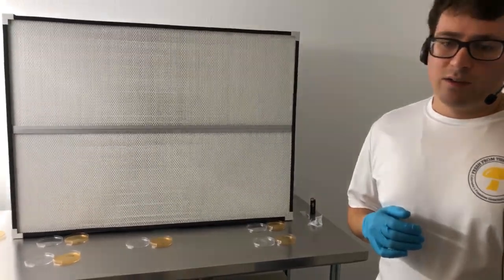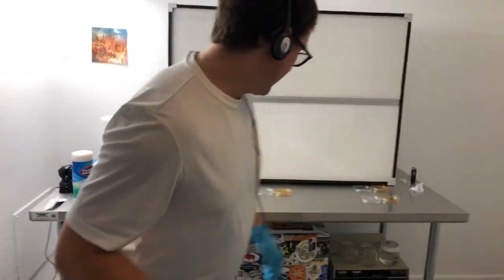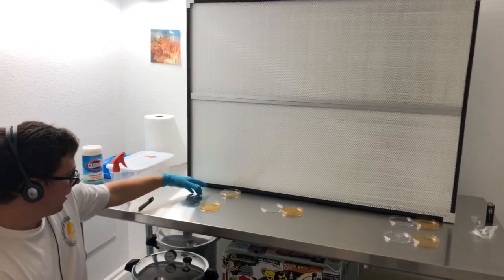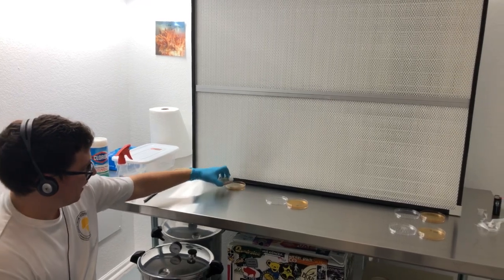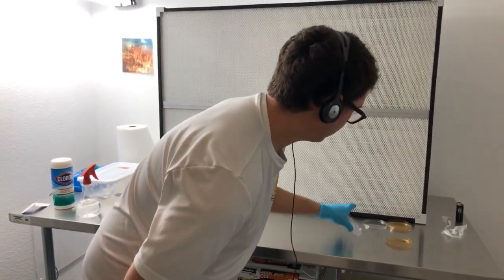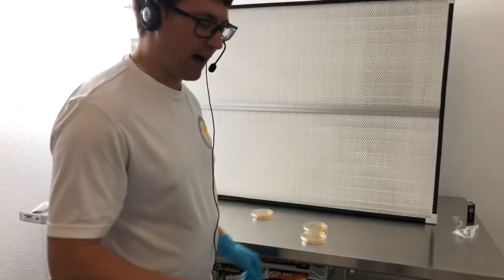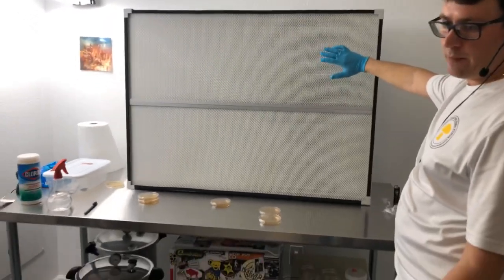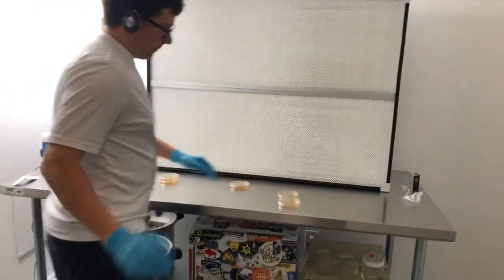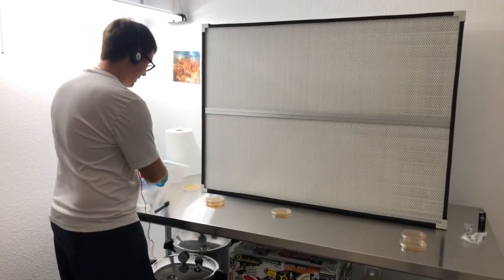I'm using MEA — malt extract agar — which is very nutrient dense and will catch anything down to one CFU. There's the timer; I'm going to go ahead and close my plates. We will incubate these at 72 degrees for 48 to 72 hours and leave them until next week. Ideally they should have zero growth. I'll put a star on zones four and five because I put my hand above them — if there is not proper laminar flow, those could show contamination. Now I'm just going to seal these up with parafilm.